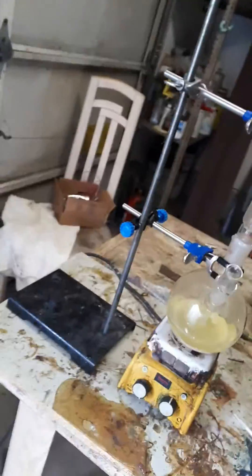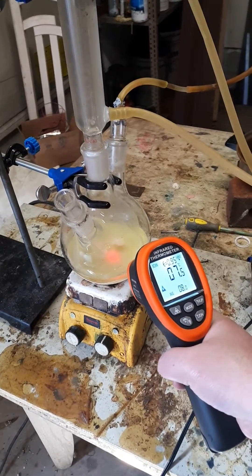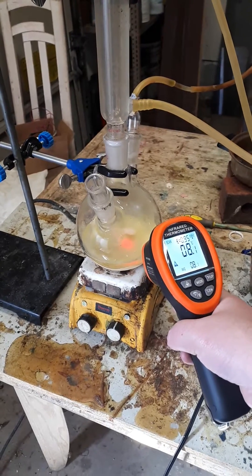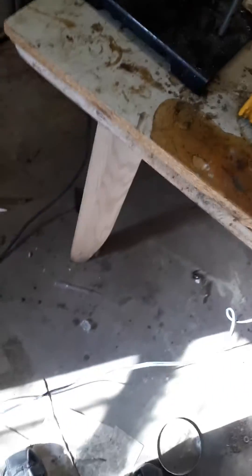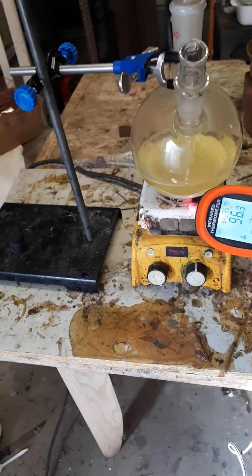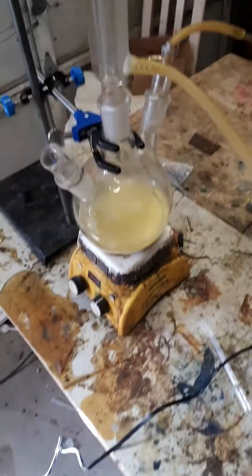The temperature is reading 7 degrees. 88 degrees on the hot plate, 96. A little bit colder because I leave the door open, but it will work. 99 degrees on the hot plate, 90 degrees on the other side.